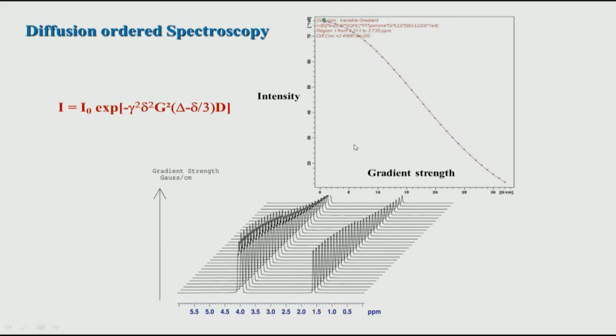If I increase the G value, it becomes harder and harder to rephase them back and the signal becomes lesser and lesser. Why does it become difficult to rephase them back? Because the small diffusion D will change the phase values so much that rephasing will not help, because now the locations have changed. You need a very accurate repositioning for the rephasing. It will not rephase because the molecules have moved away.